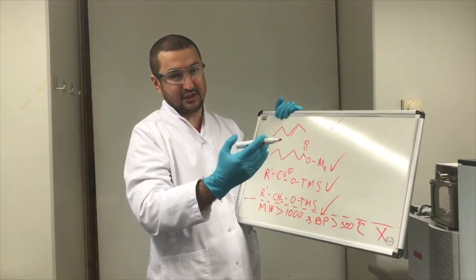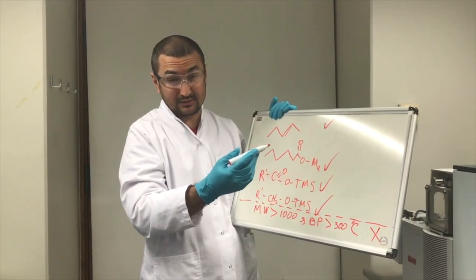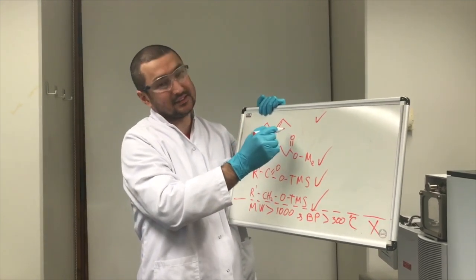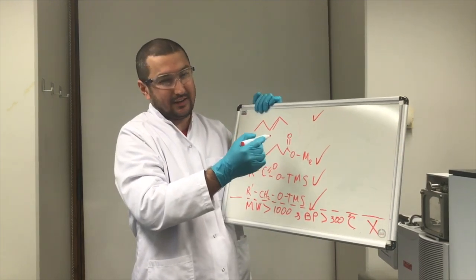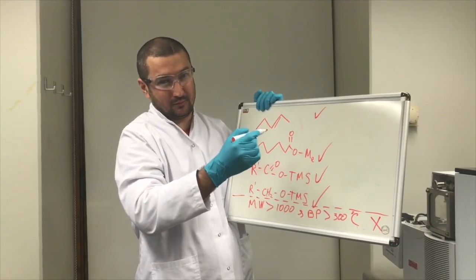Using such kind of GC-MS, we can analyze volatile and semi-volatile compounds. So by volatile, I mean the compounds looking like this, which are easily volatile, and when you heat them, they don't break down. They are thermally relatively stable, so they can travel through the column.